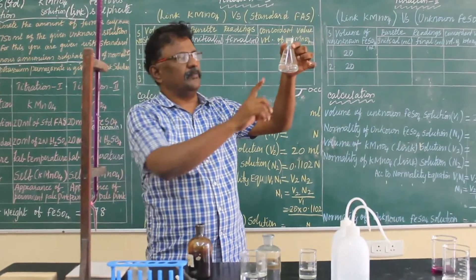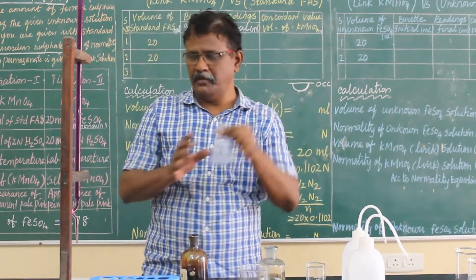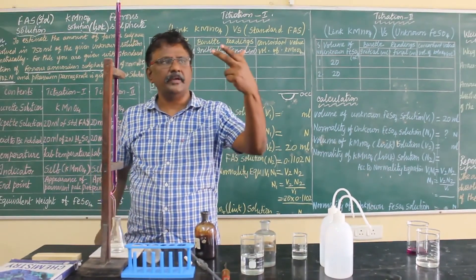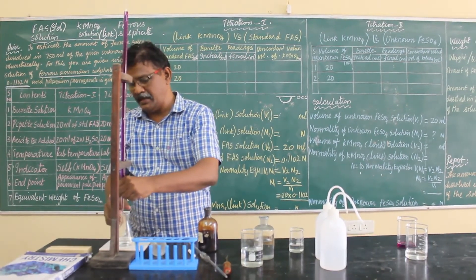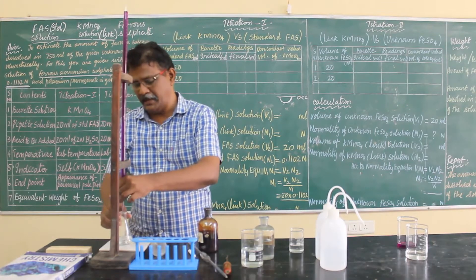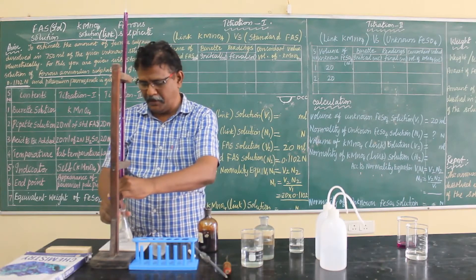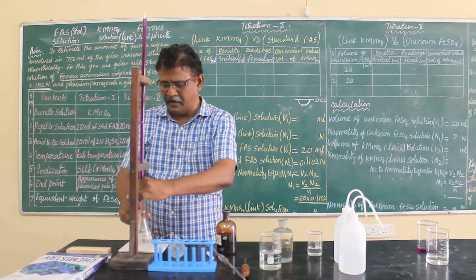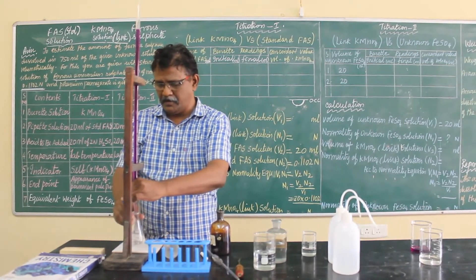Now the conical flask contains the pipette solution and dilute sulphuric acid. Start the titration. You have to use your left hand — keep your thumb finger on one side and the other fingers supporting on the opposite side — and just release the stopcock slowly, adding drop by drop until you get a pale pink color.